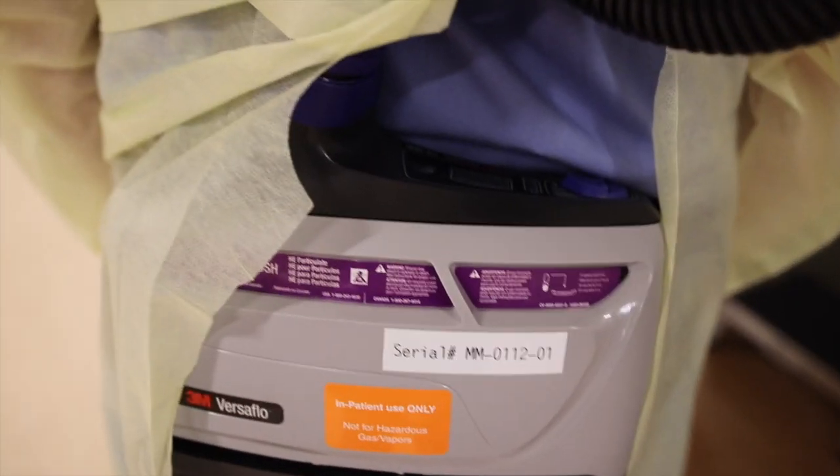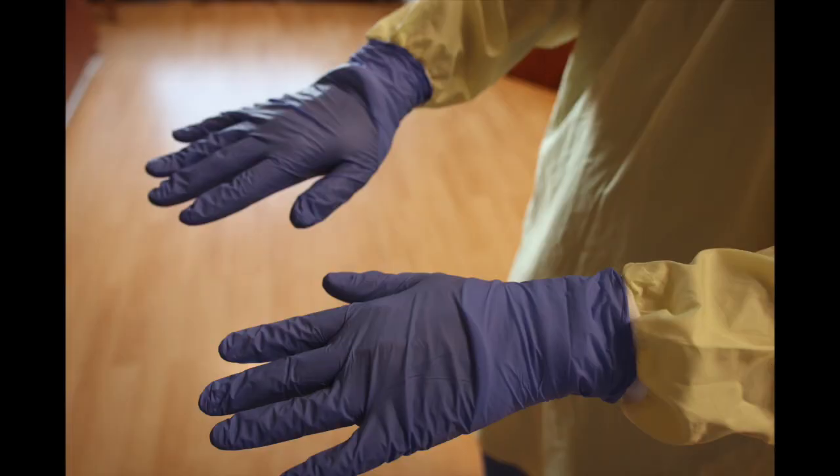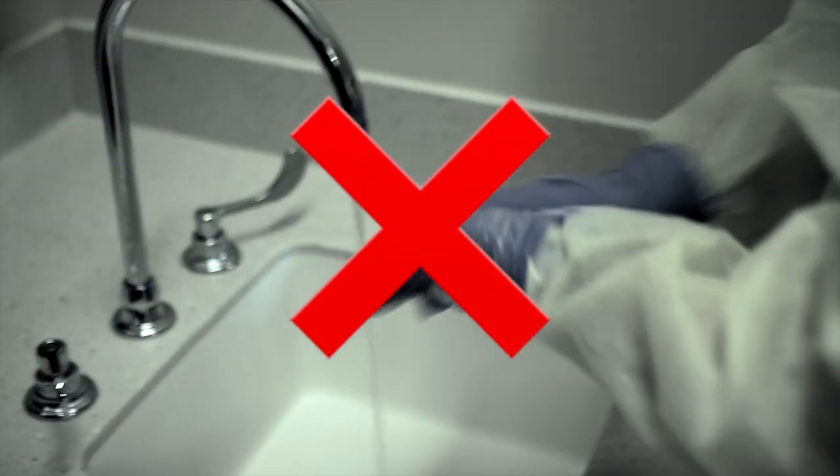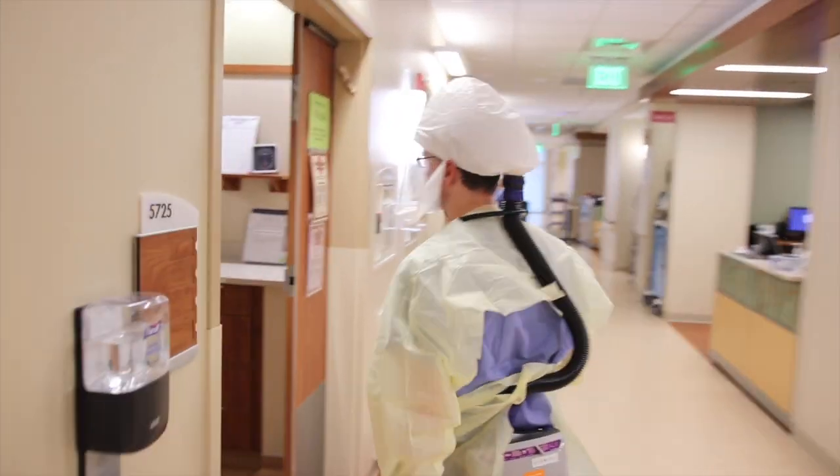Then put on your gloves, and again, if you are using a reusable gown, ensure that the gloves are covering the elastic part at the end of the sleeve. As with all other COVID protocols in this video, washing gloved hands is not recommended in the PPE protocol. Once you are ready, grab your equipment and you may enter the room.